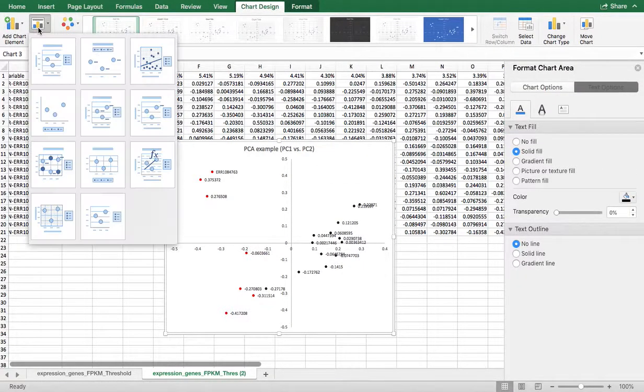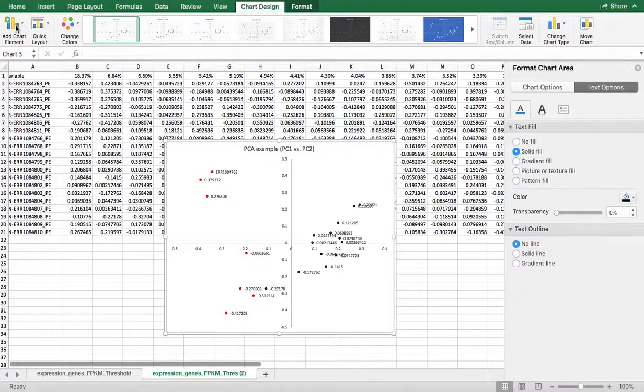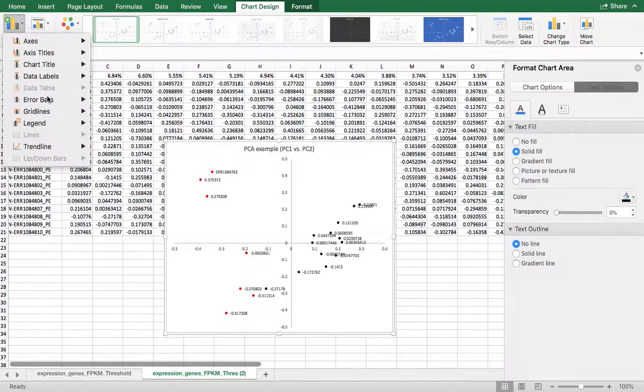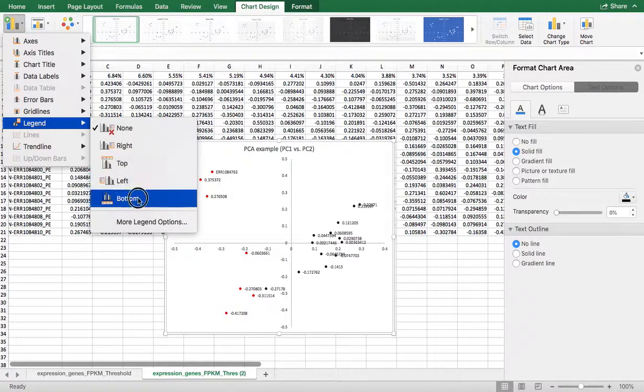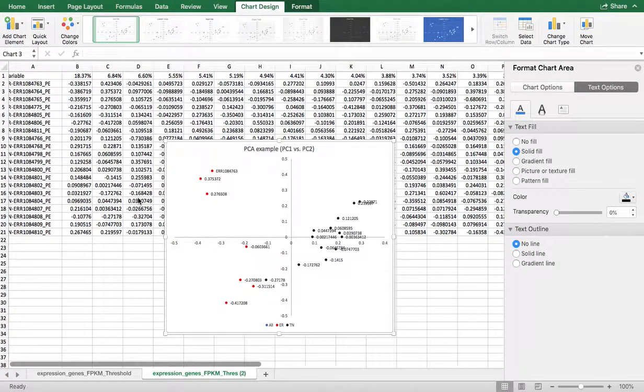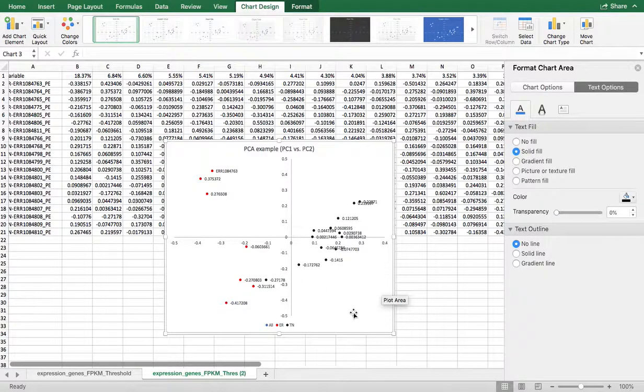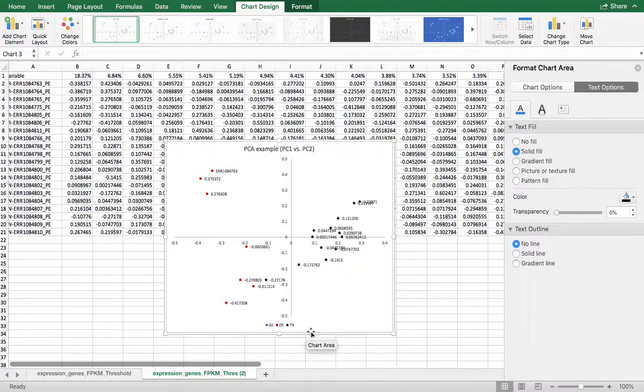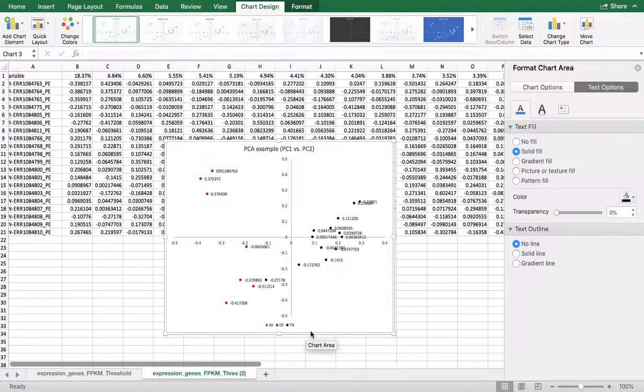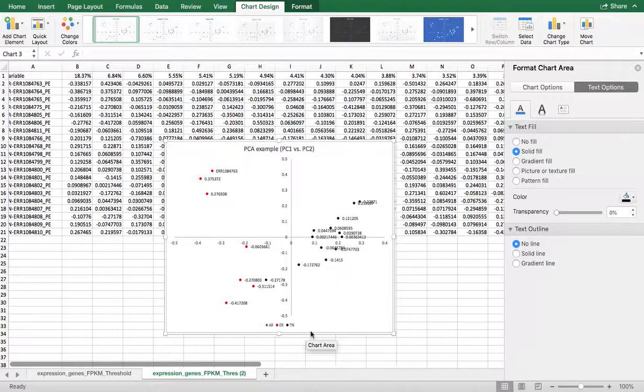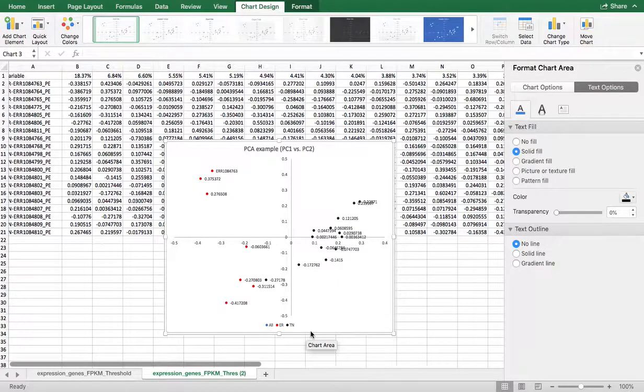Just before we finish, let's go ahead and add a quick element here and do a legend at the bottom. Now we can see these are ER and TN. I hope this was helpful. I will be posting more of these later on, and I will show you another way that you can do a PCA chart in a much quicker way.